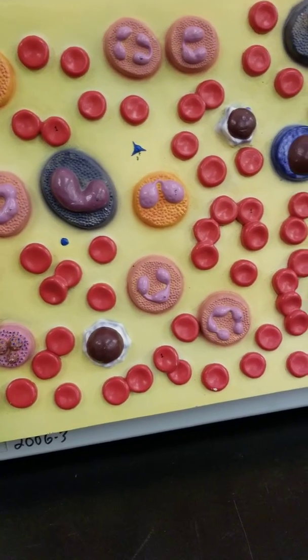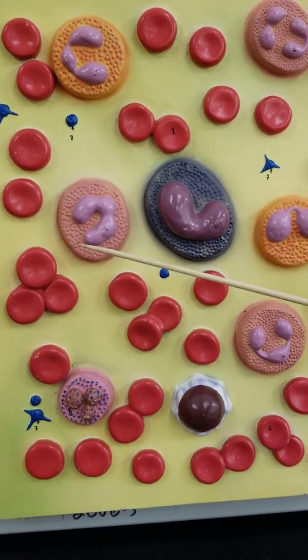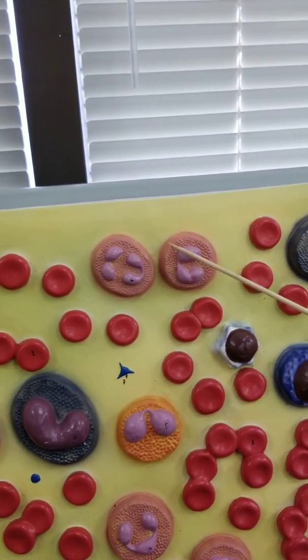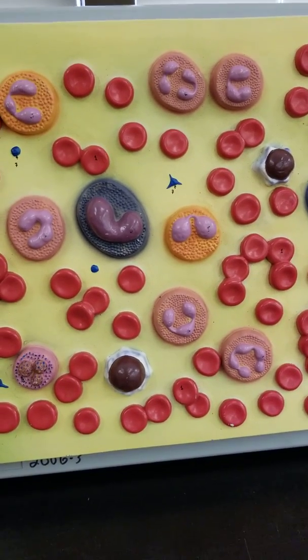So type number 1, these here, which you can see have granules in the background, but they don't stain either red or black. These would be my neutrophils. So this is a neutrophil, these 2 are neutrophils, and these 2 are also neutrophils. It's one of the most abundant types of white blood cells.